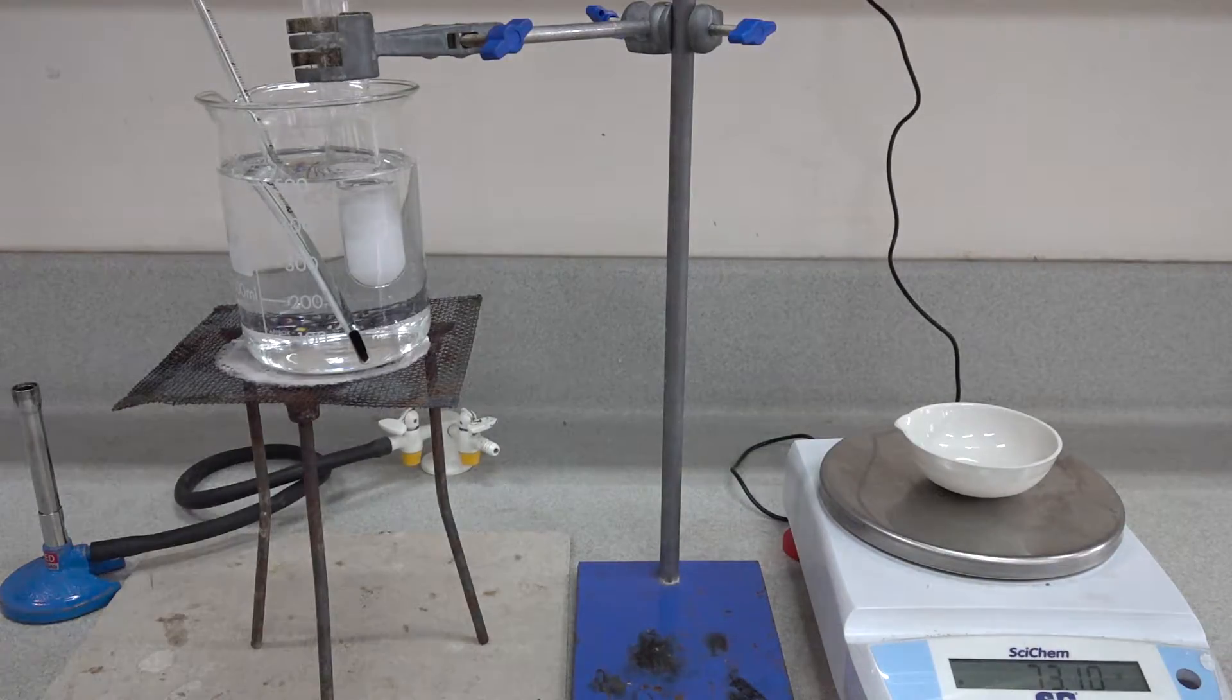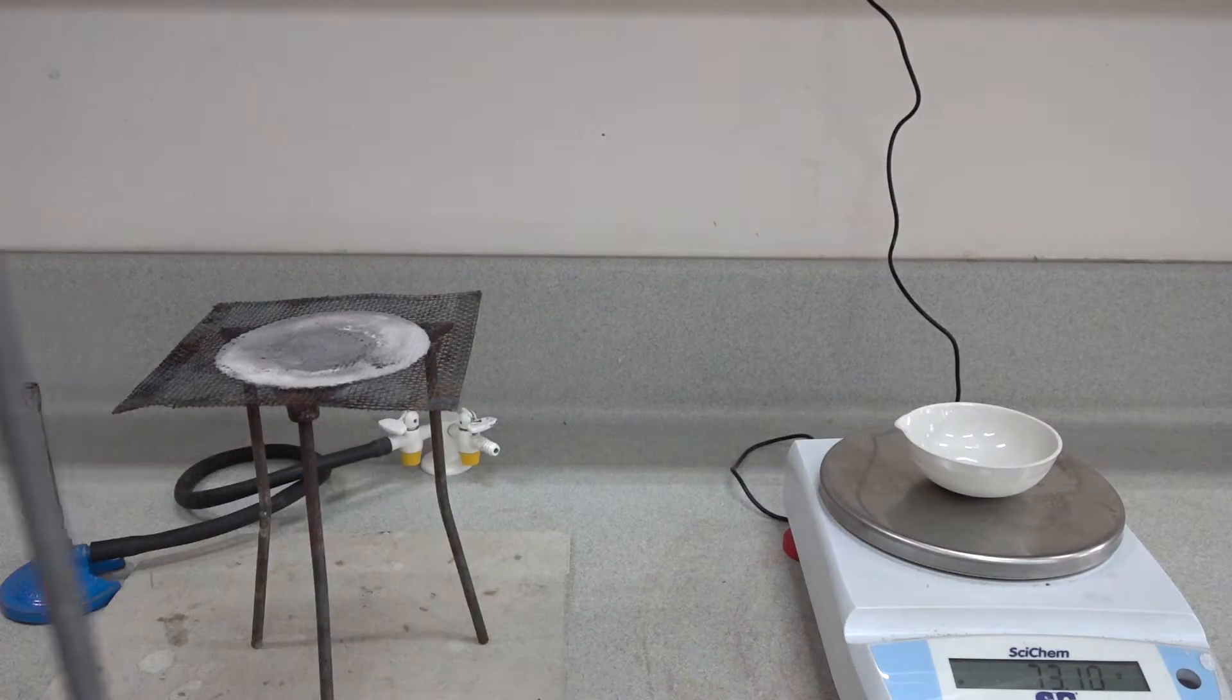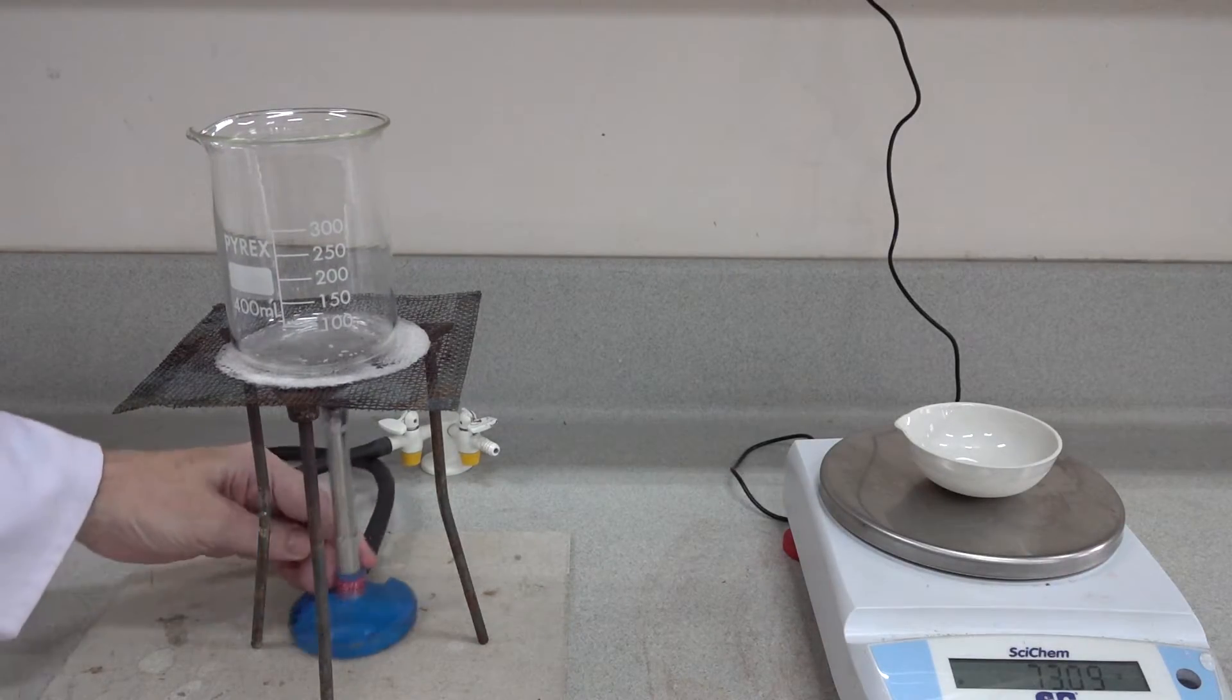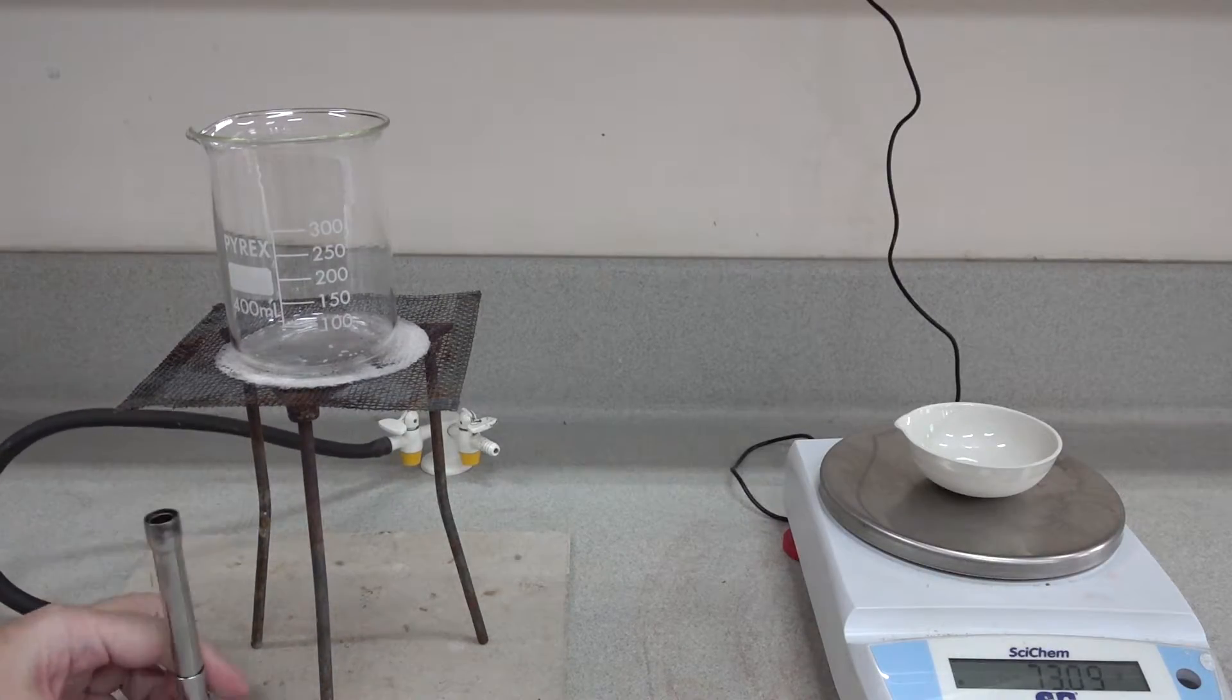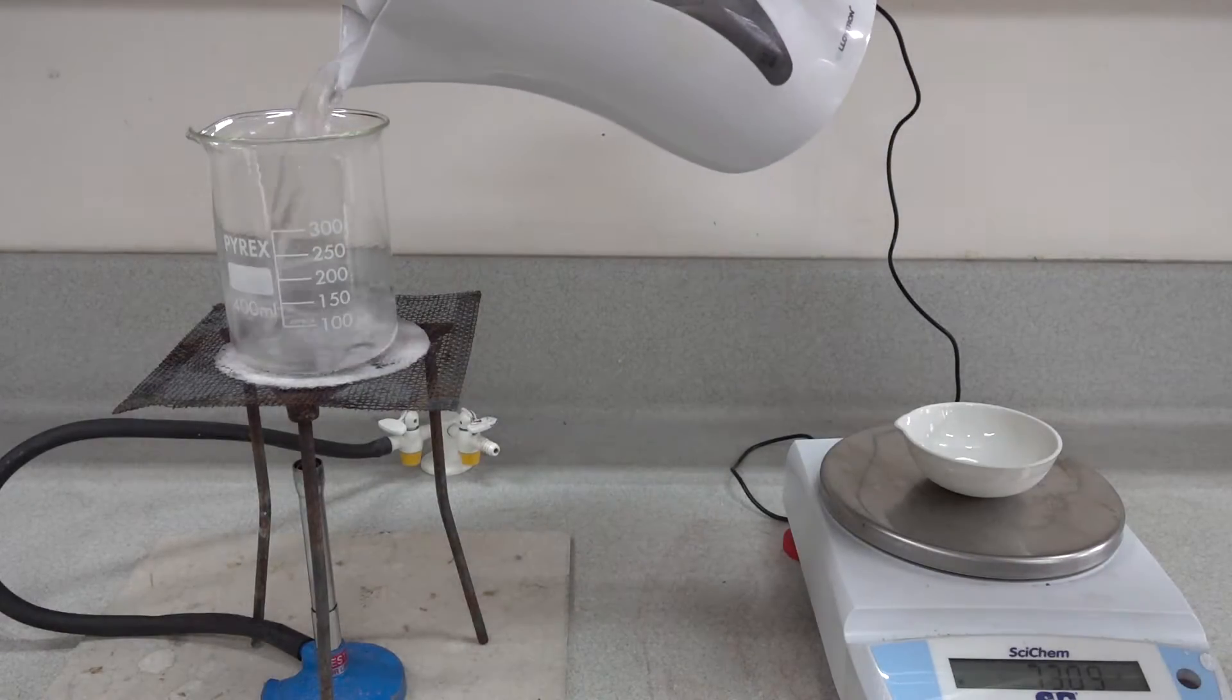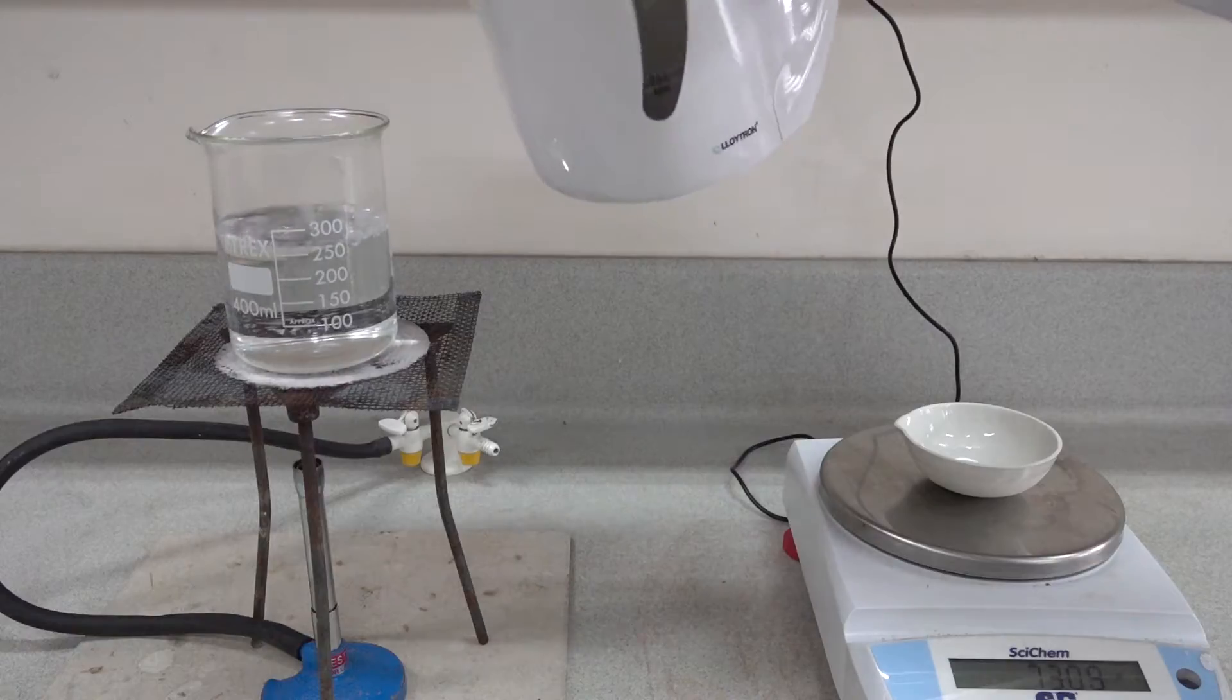We can now dispense with the water bath and the potassium nitrate, and we now need to introduce a water bath on which we can evaporate our solution. So a kettle of hot water here will provide the starting water.